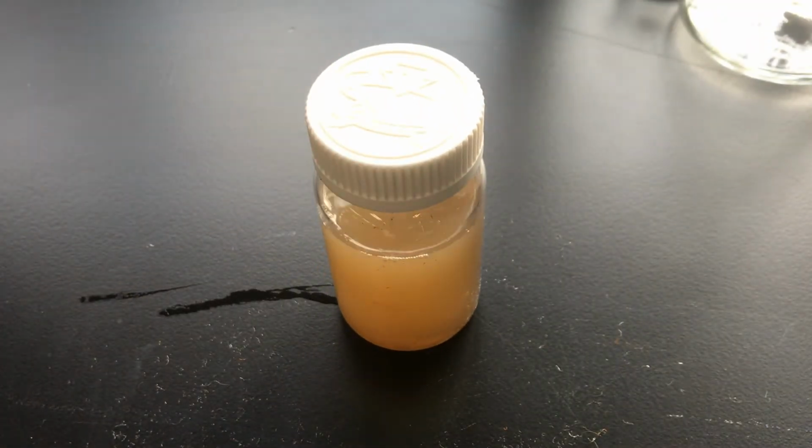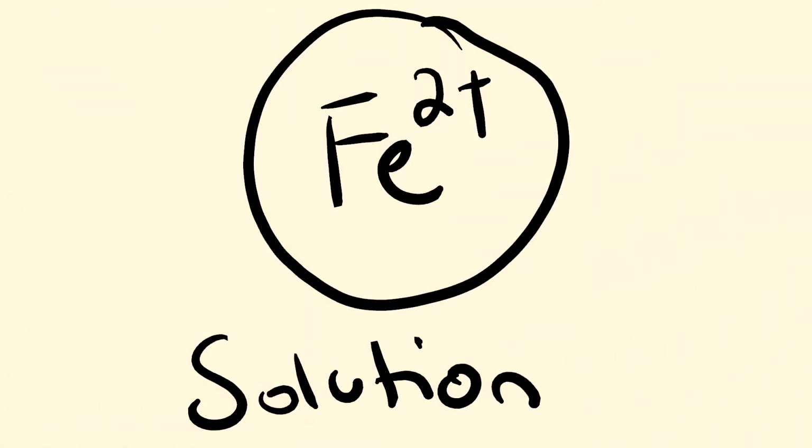The rust is then dissolved into a solution. If the steel wool is left to rust for a longer period of time, then the solution will be much stronger. However, the reaction does not require a very strong solution containing ions. This solution looks quite cloudy.